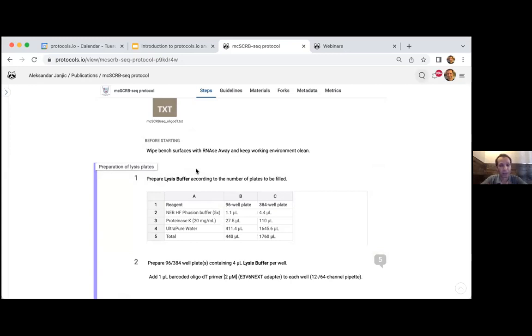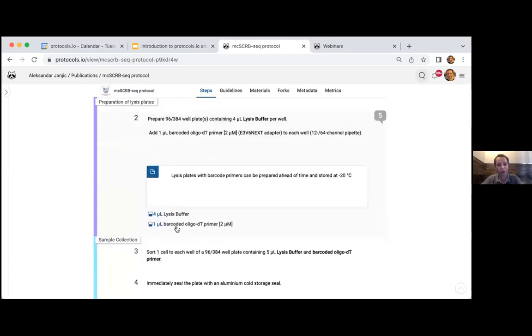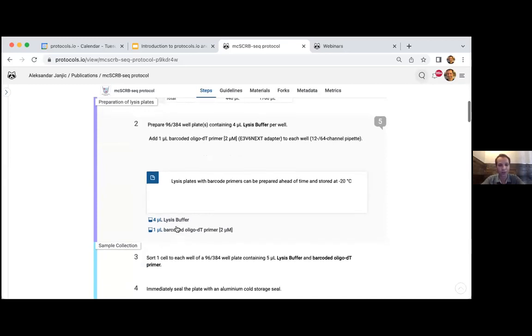We've connected with reagent vendors. If you're doing molecular biology, for a lot of the reagents that you use, you just type in a catalog number and it will recognize it. So we're trying to let you record the necessary details for reproducing your work, by yourself or others.